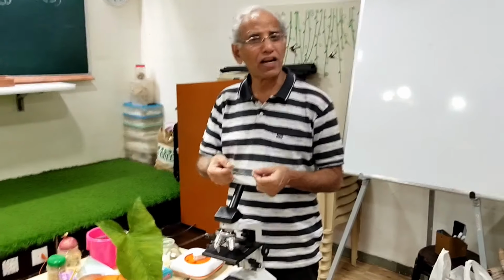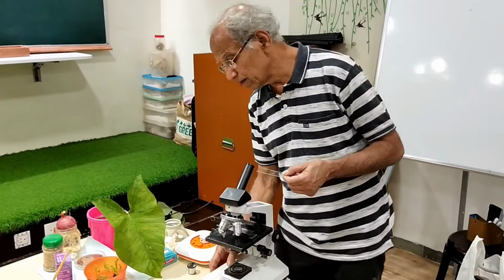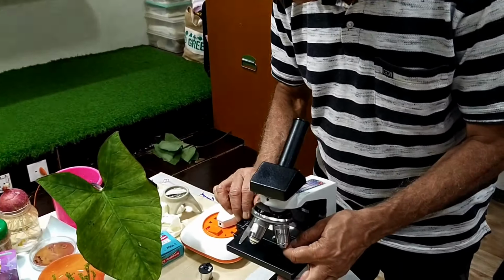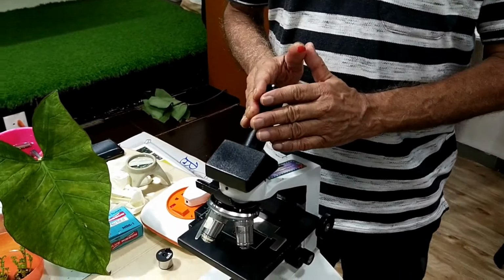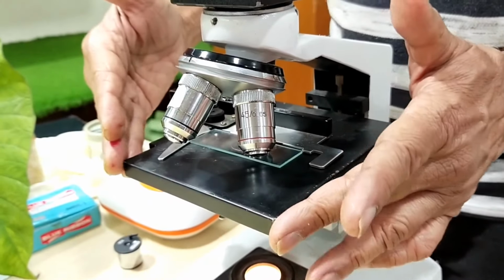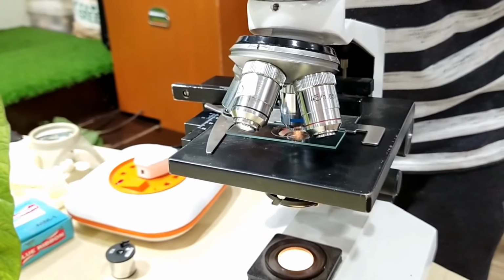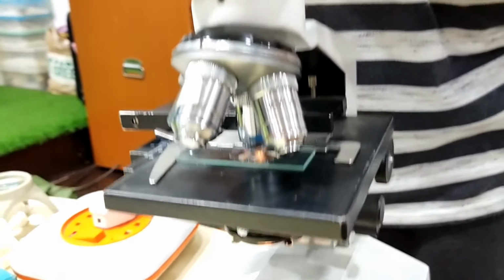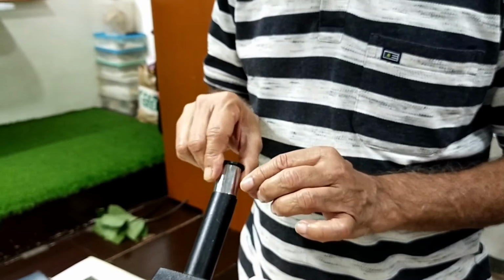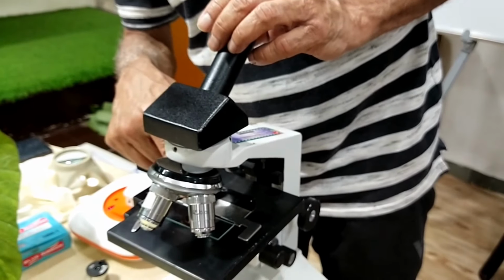So here is the slide that we have just now prepared. I will now adjust it under the compound microscope. I think most of you are already well aware of the parts of the microscope. This is the base, and this is the platform on which the object is placed, and this is a lens here which is called the objective lens, the lens which is closer to the object.